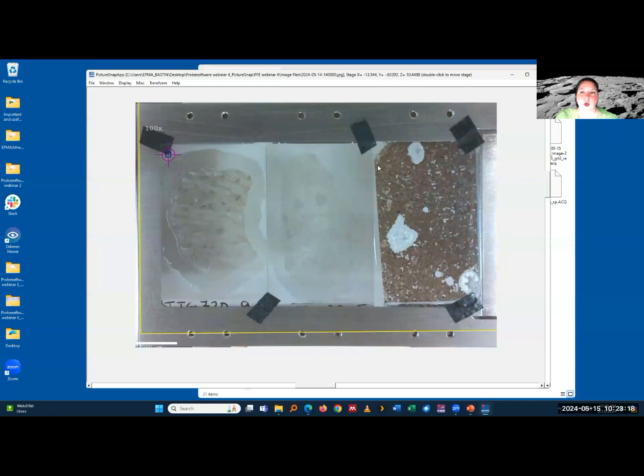And just as another note, one of the reasons why I tape my thin sections extensively into the holder is because I really love using carbon tape. A big part of its usage is that carbon tape is very easy to see in your camera picture. It's very easy to see in your secondary or backscatter image. There's no question which one is which.